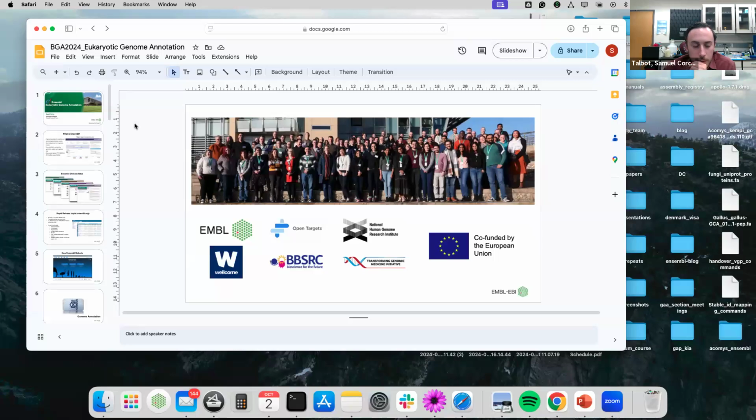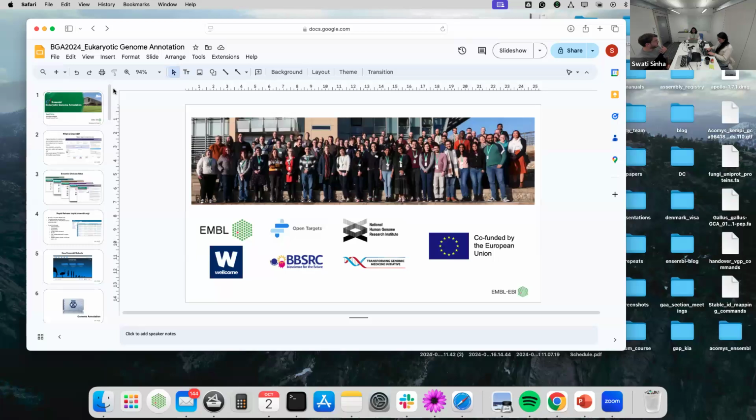This is for after we get the annotation, to assess the quality. Sometimes we can check by doing a reciprocal BLAST hit to assess the one-to-one orthologs. Okay, I'm not really familiar with that part.